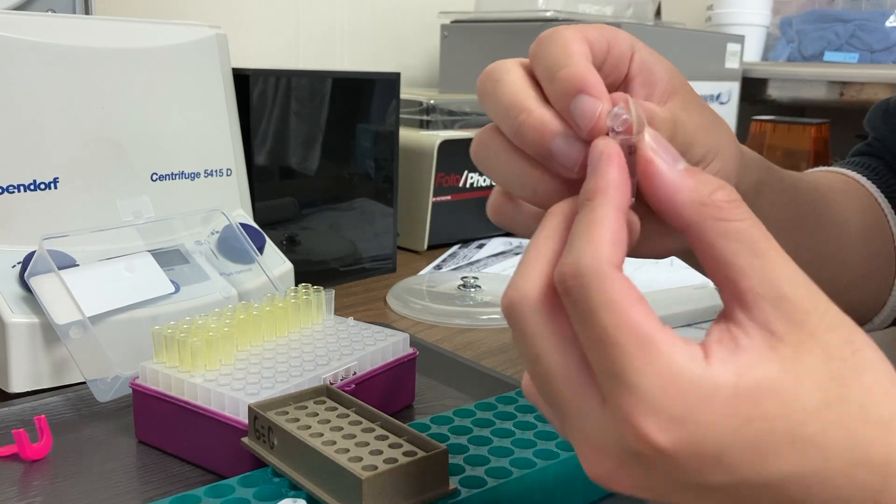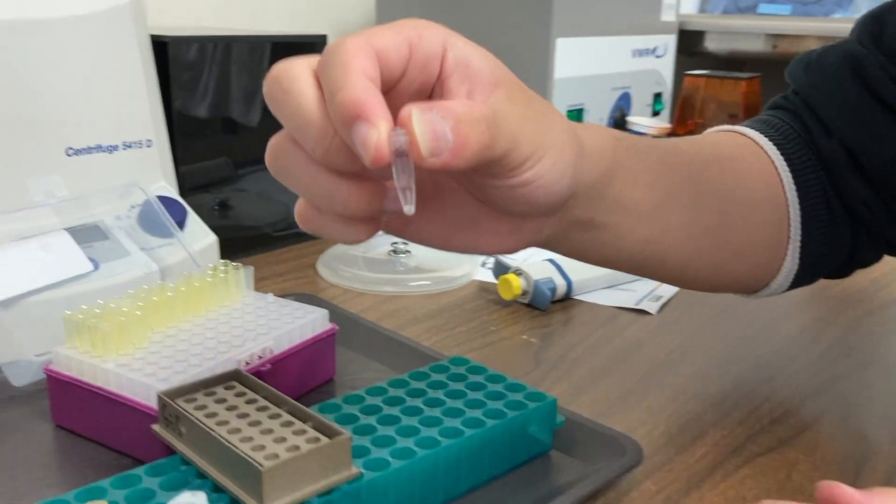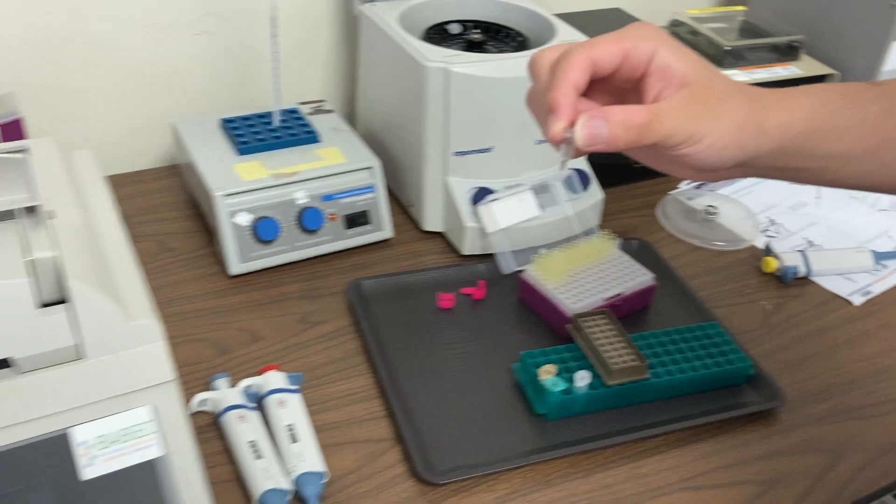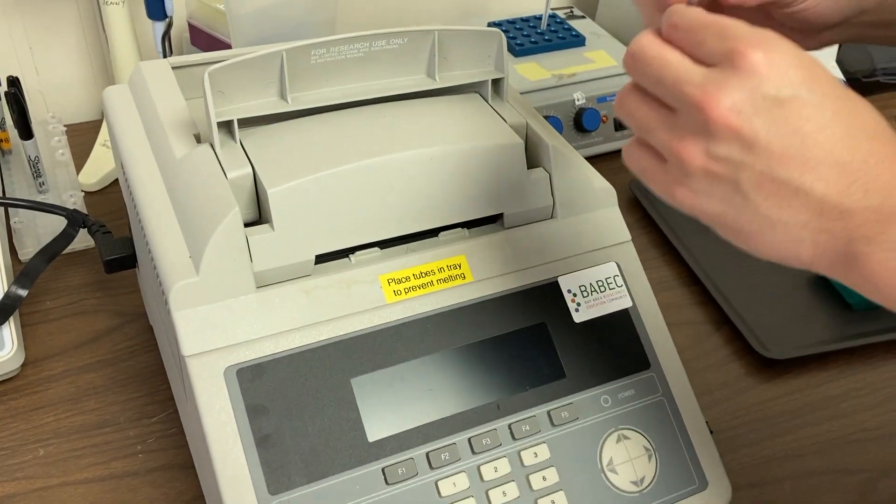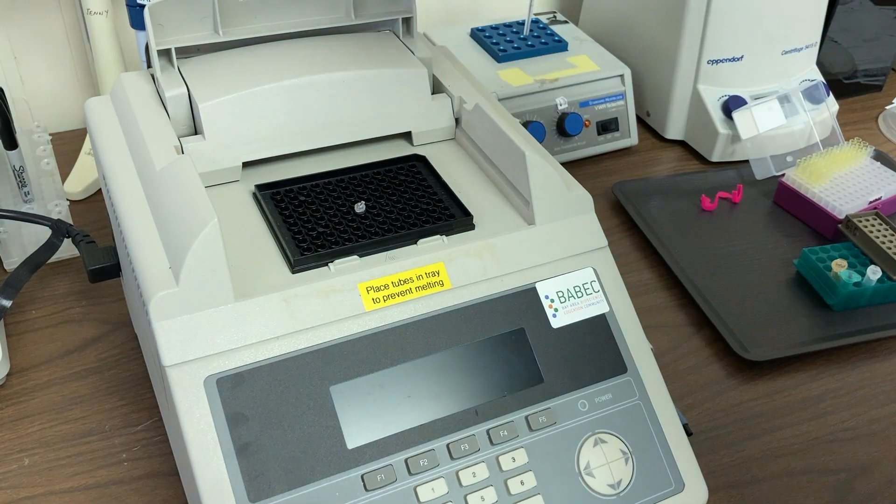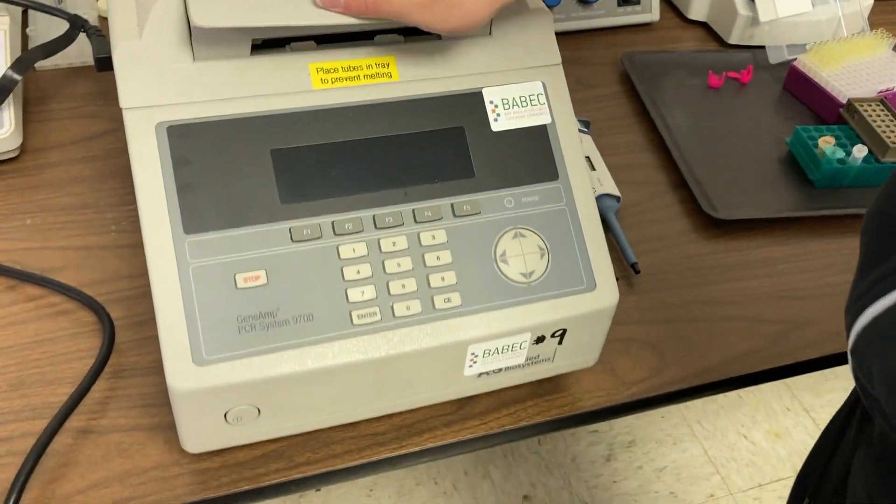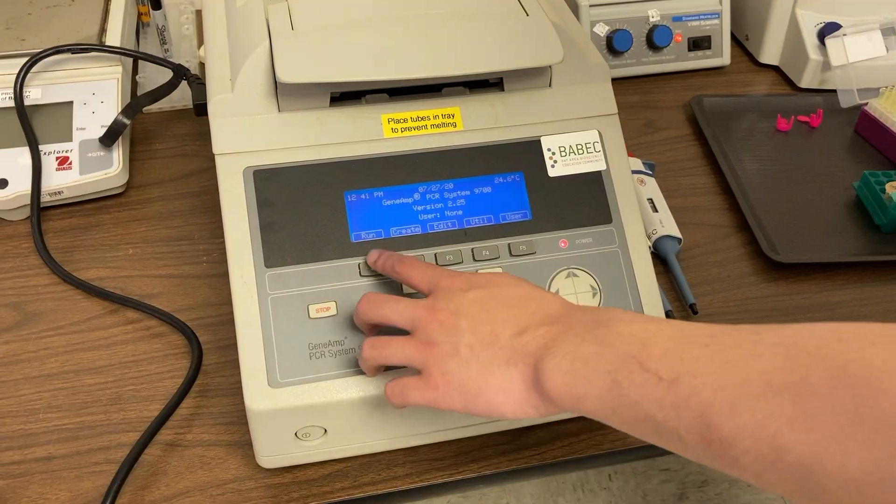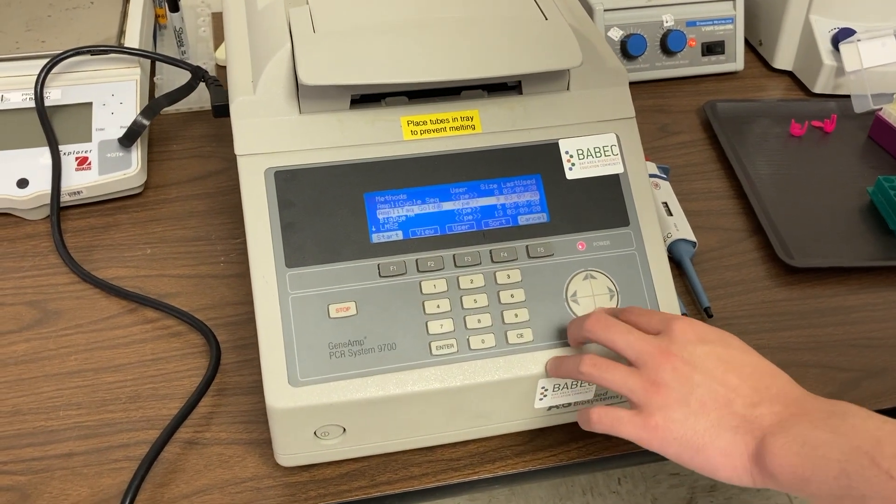And now your reaction is ready for the thermal cycler. The thermal cycler is the machine where the polymerase chain reaction, or PCR, takes place. You may have read in the reading that the thermal cycler can increase its temperature very quickly to a specific temperature. It can also cool down very quickly to a specific temperature.